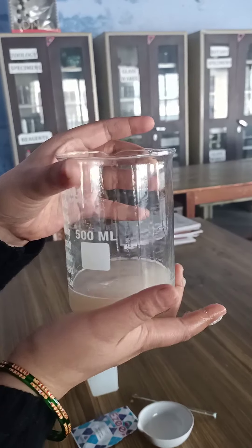Now you can see that we have strained the solution completely. We got this solution in the beaker. Leave it for 10 minutes, and after 10 minutes we will perform the next steps of the experiment.